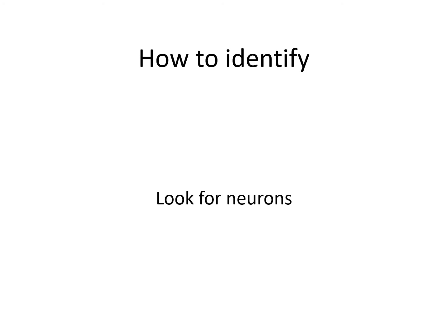Let's spend a moment talking about nervous tissue. Now the great news here, there is only the nervous tissue as a general category, and there are no specific types. The best thing to do when you look at nervous tissue is to look for neurons, which are the impulse conducting cells of the nervous tissue.